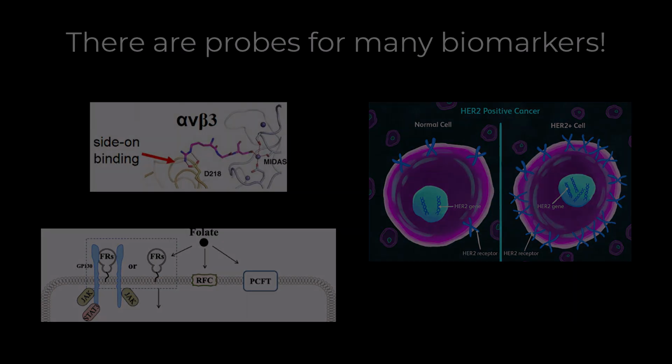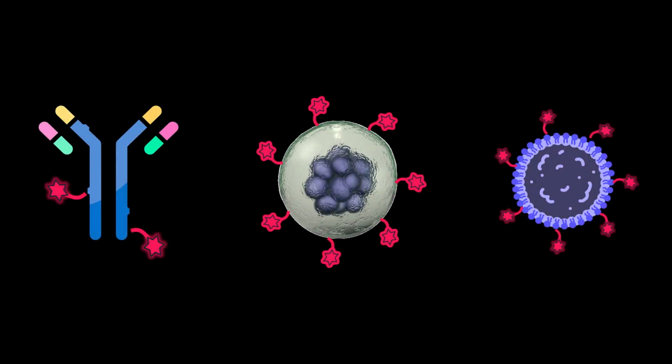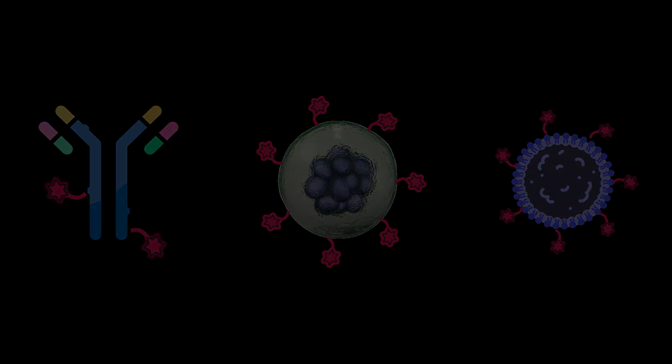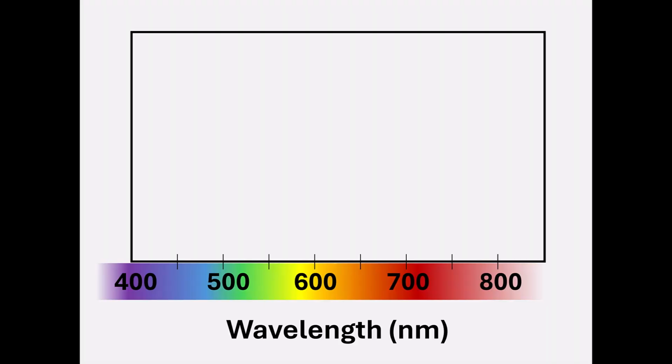In addition to using commercially available targeted and activatable probes, you can label your own antibodies, cells, and nanoparticles. Fluorescence imaging agents are very adaptable. Strategies can be implemented quickly for use in multiple types of experimental procedures. Unlike bioluminescent and fluorescent proteins, fluorescent probes can be translated into clinical use. The imaging agents we will highlight fluoresce in the far-red and near-infrared wavelengths.